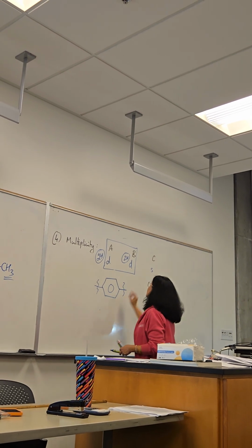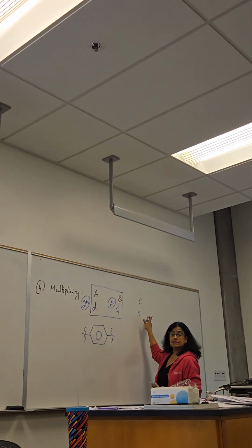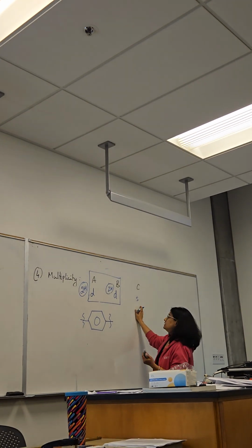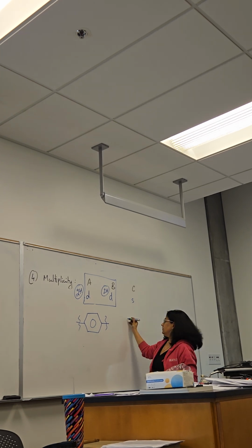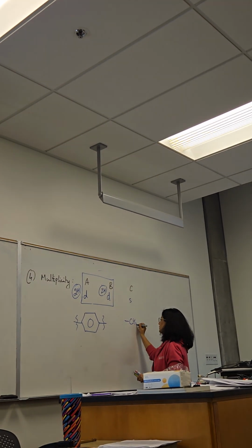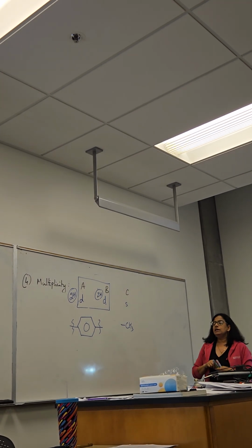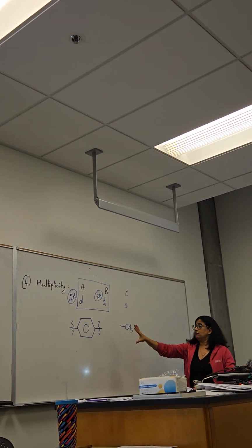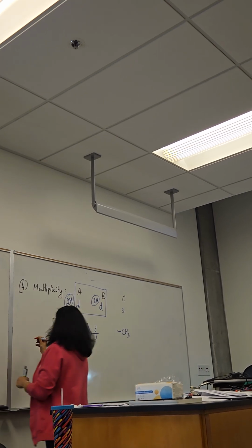Okay. What about this? We said it is a CH3, that's a singlet. Singlet, which is CH3, means it is not connected to any other hydrogens. So we have a CH3. Agreed? Can we just pause here for a moment? How many carbons have we accounted for by these 2 pieces alone? All 7.